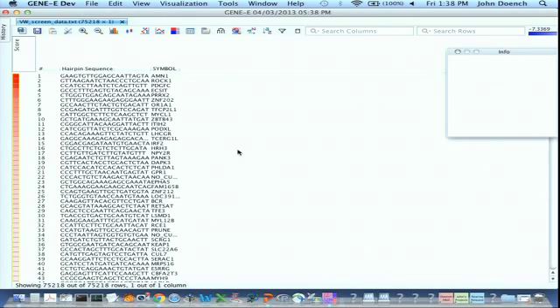Now, I should point out that GeneE is an incredibly powerful program developed by Josh Gould, who sits up on the 4th floor, very nice guy. It does a ton of things. I'm showing you about 0.1% of what GeneE can do. It was developed largely to look at microarray data. I'm just showing you one very tiny tool that it has. It's a program with a whole host of other functions. It could be a BroadE seminar in and of itself, and there's lots of resources to learn about BroadE, or to learn about GeneE.